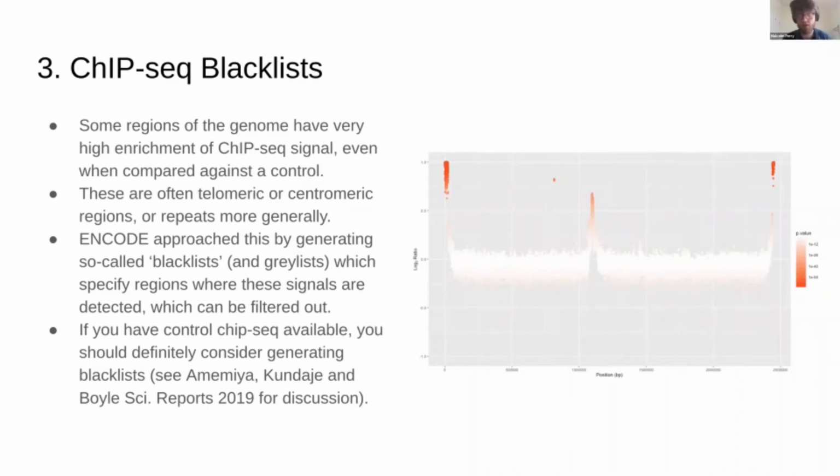Especially if you've looked at a bit of this data, it's often quite obvious when this is happening, because the peaks look very strange and very highly enriched, and everything looks a bit wrong if you open it in a genome browser like you did in the last tutorial. But it's just worth noting that this can help your analysis. Basically, it can help it go a bit smoother. Okay. Thank you.